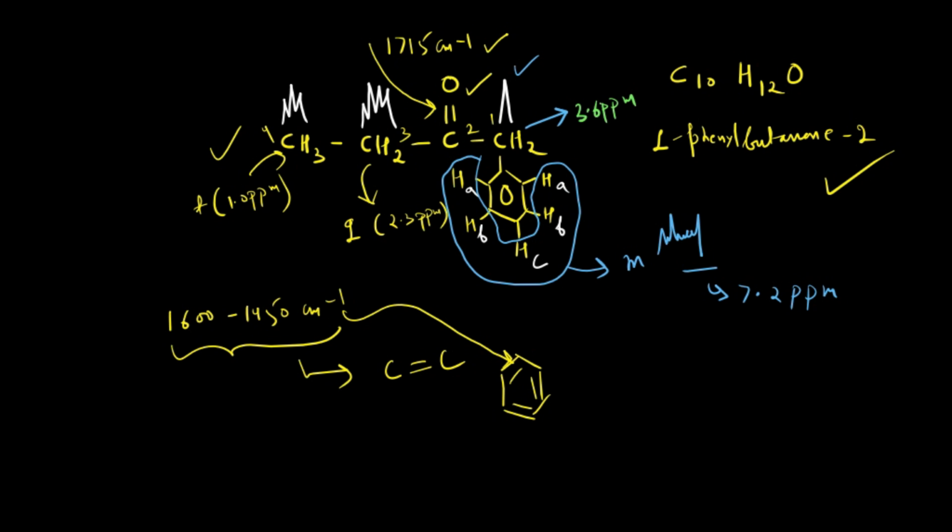Now let's move further to check another isomer for this particular compound. Because this is the isomer, right? And if it is the isomer, one thing is sure, that means the presence of the benzene ring, this is sure. And since it is the isomer, this functionality may also be present in here. Okay, now you see, this is the singlet, a very large singlet appearing at 2 ppm. So this is a signal which is not split, but here you are getting a pair of triplets.